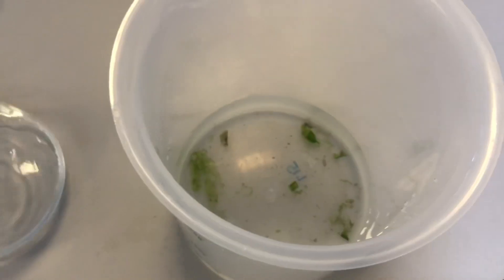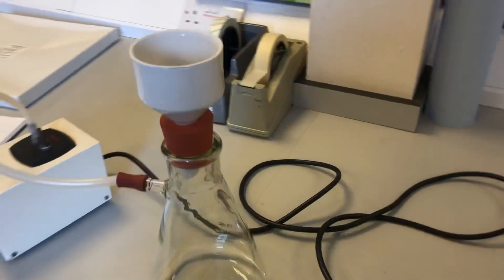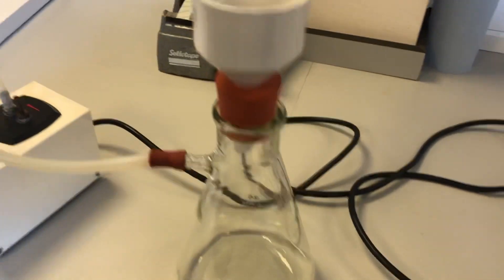So as I mentioned before, I was having problems with my bacteria growing the biofilms in the plates, so I've tried a new media again this week which involved seawater to see if they grow better in a natural media rather than the artificial one I've been using. I filtered the seawater on Monday, which was fun - I was in a different lab, so it was nice to be in a different environment.